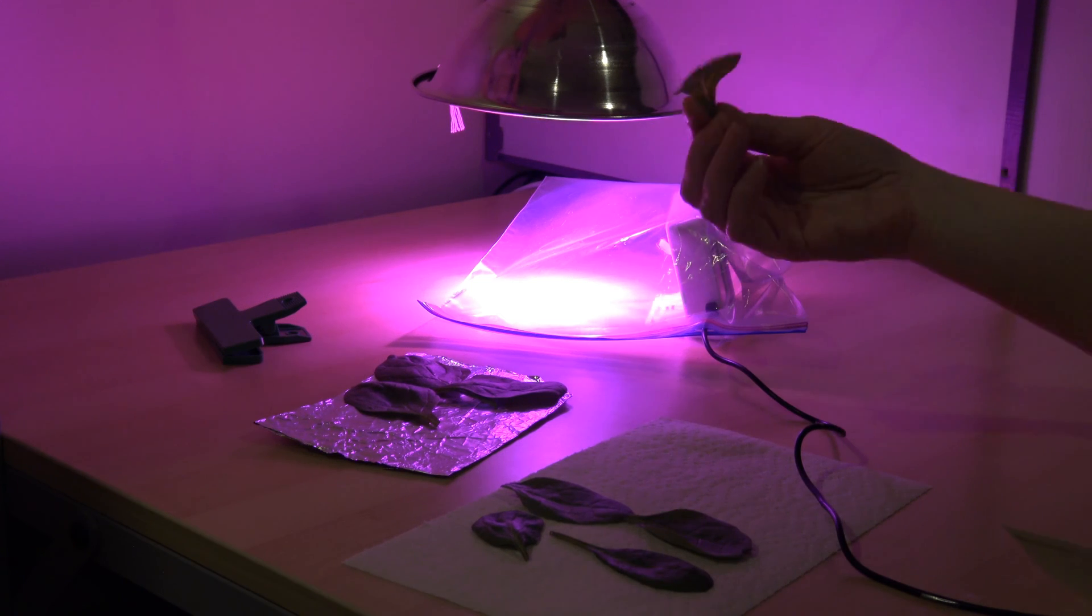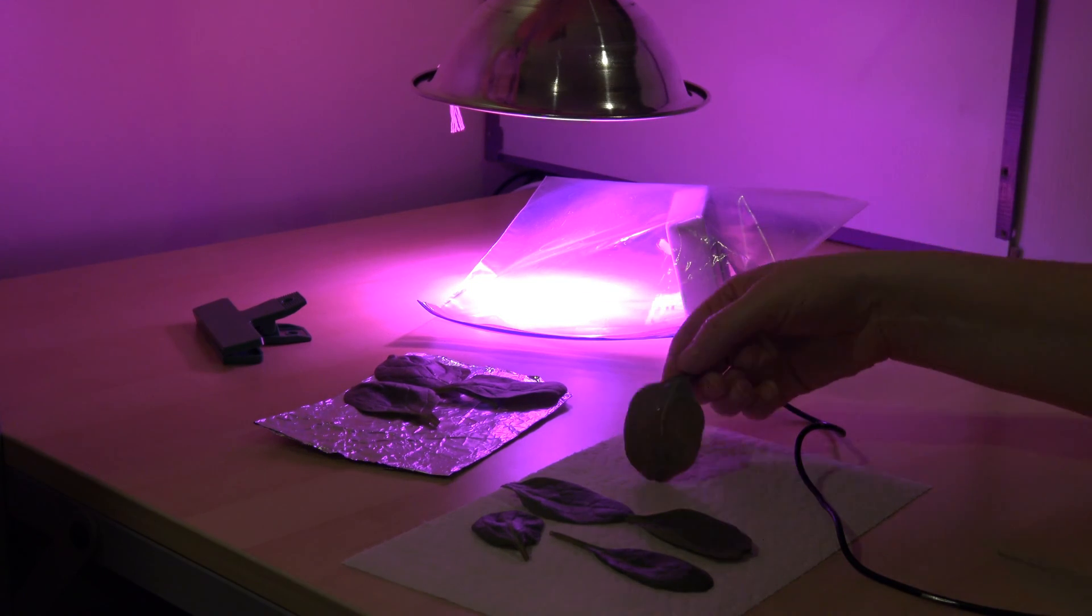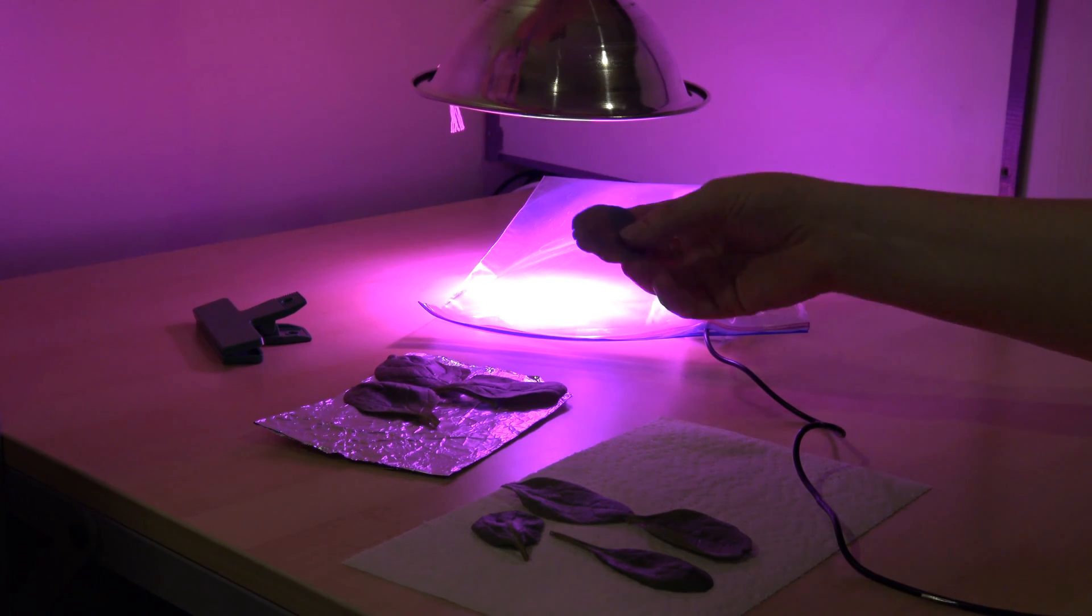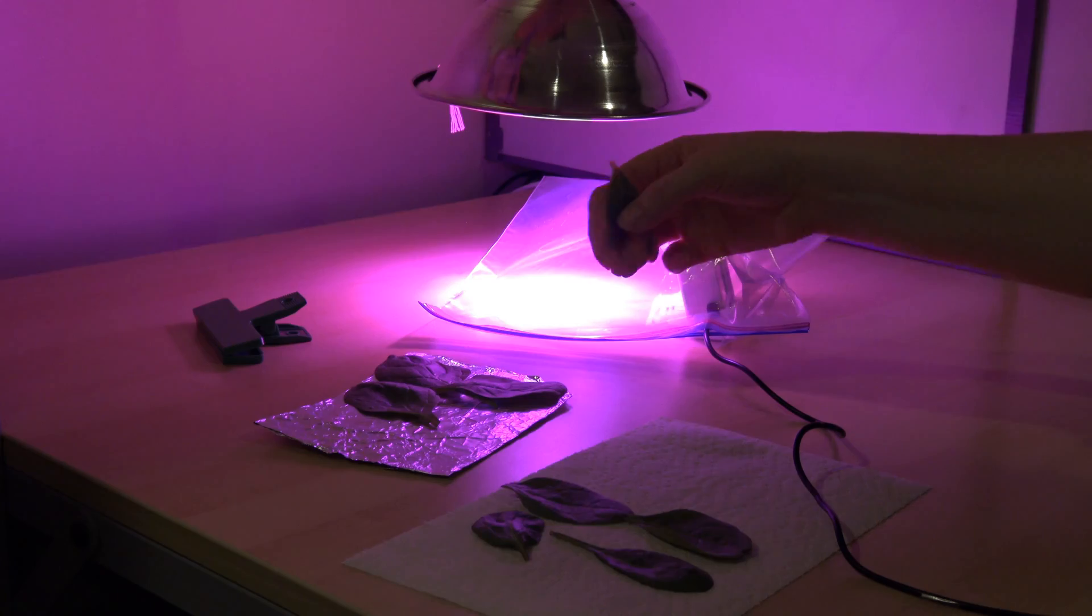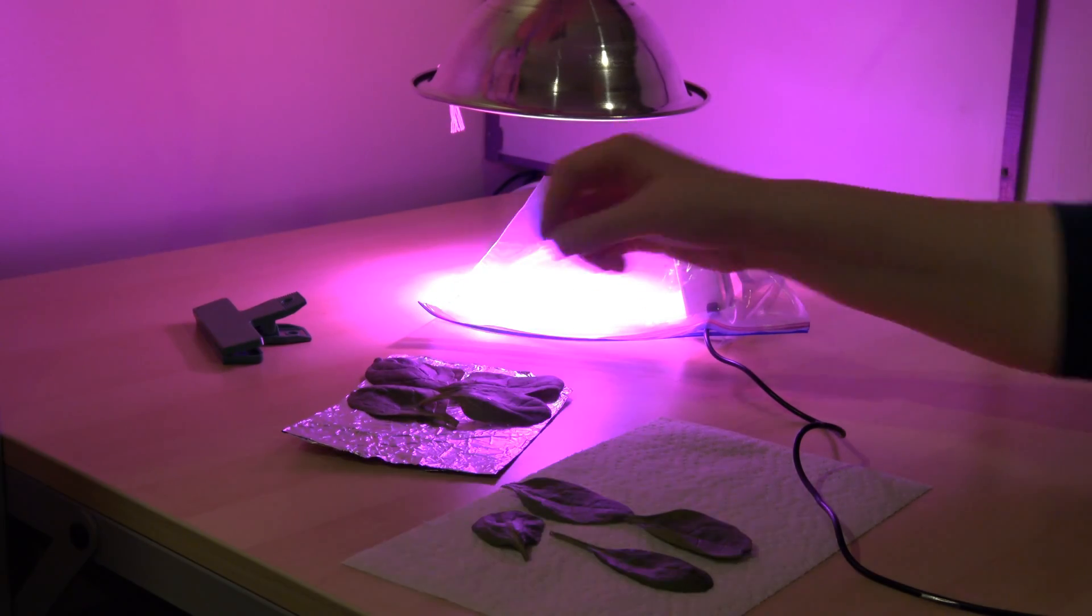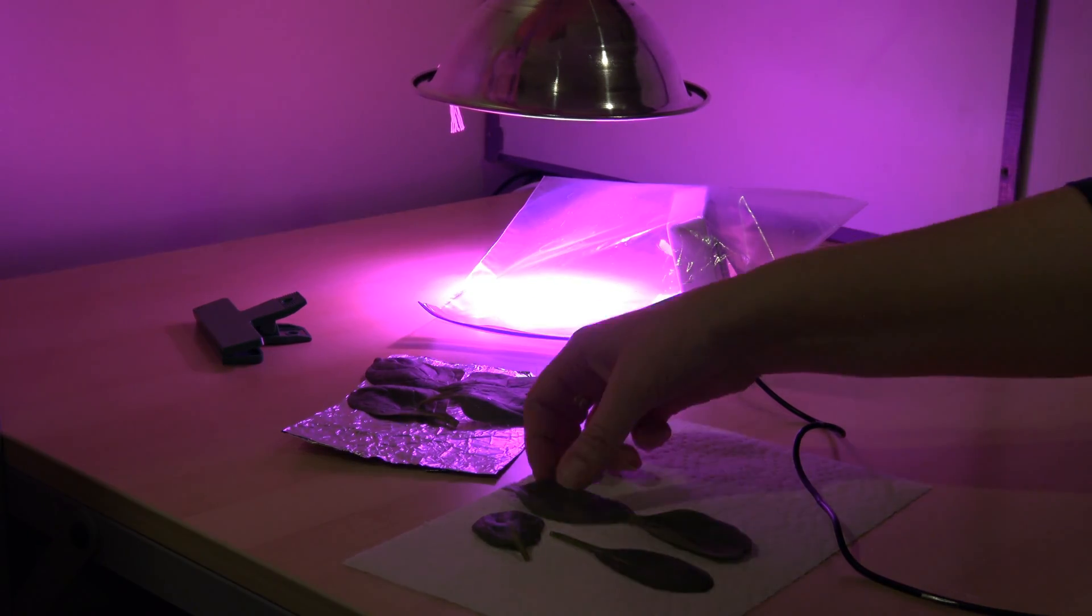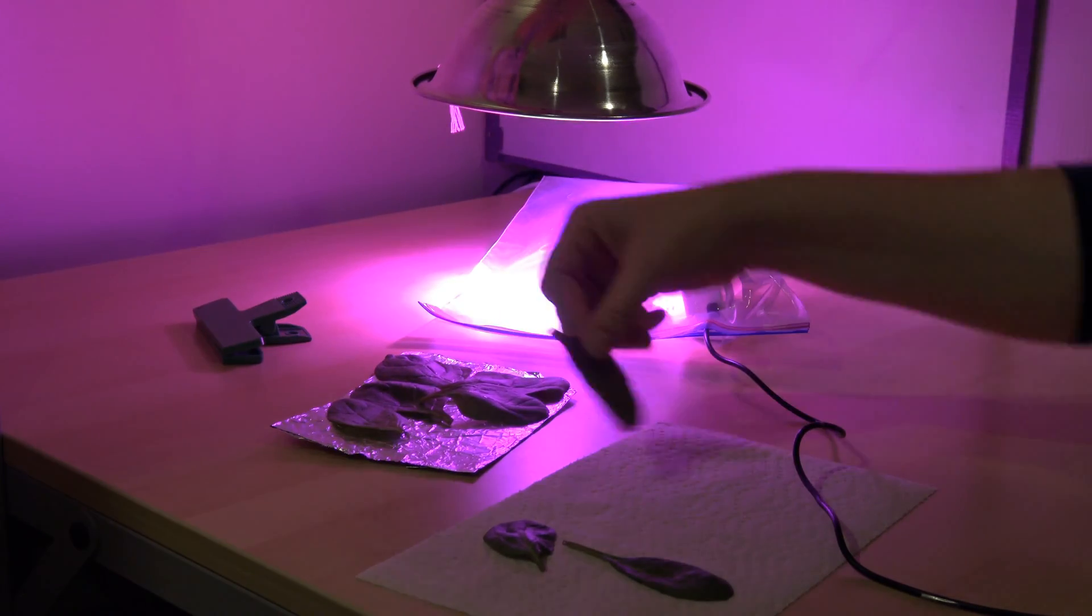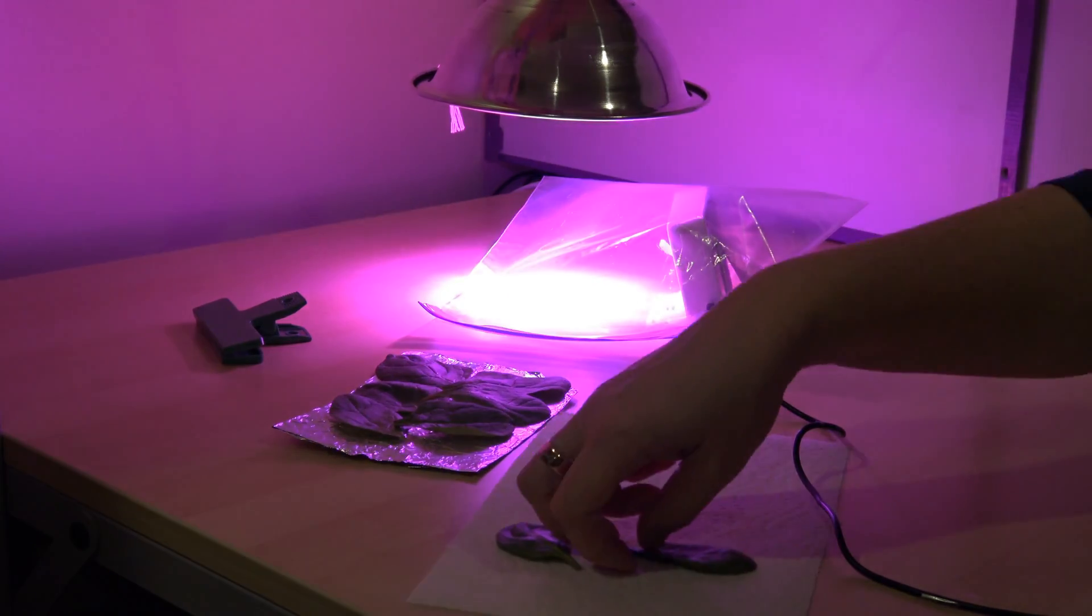When you're choosing spinach leaves from your bag or clamshell that you got from the grocery store you want to choose leaves that lay relatively flat and leaves that are relatively undamaged. Leaves with lots of damage tend to do more cellular respiration than photosynthesis and that would skew our results.